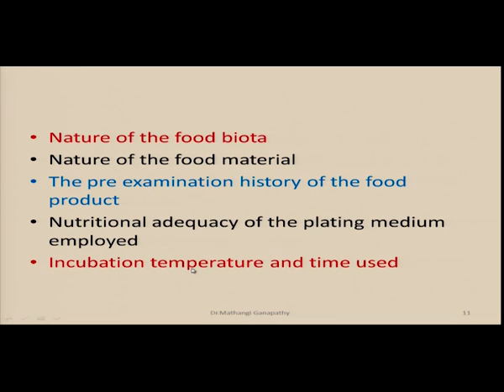Then finally, incubation temperature and time. Here you can vary depending upon whether you are trying to find out if it is a mesophilic organism or a thermophilic organism. Accordingly, the plates can be kept for incubation at different temperatures for different times, and accordingly you can find out what is the category of the microbe which has grown up in this particular sample which you have taken.